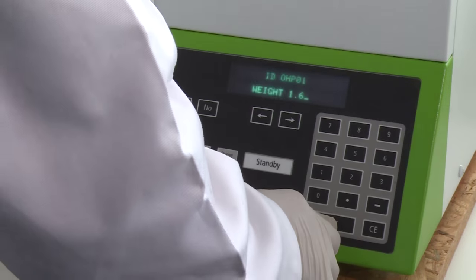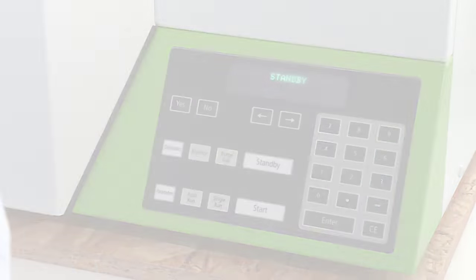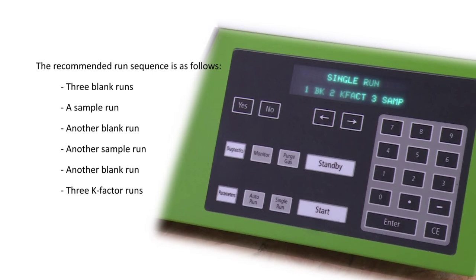The recommended run sequence is as follows: three blank runs, a sample run, another blank run, another sample run, another blank run, then three k-factor runs.